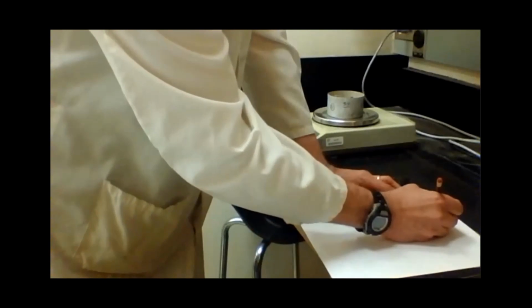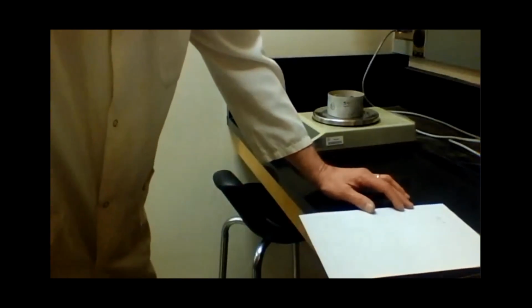181.9 grams. I know from pre-weighing the soil moisture tin that was 43.1 grams. So if I do the subtraction, what I end up with is a total soil weight of 138.8 grams.